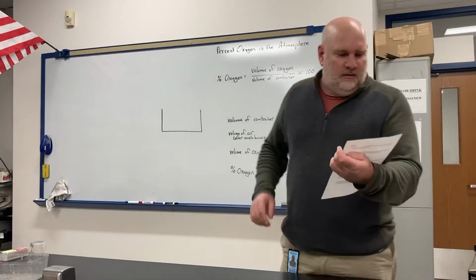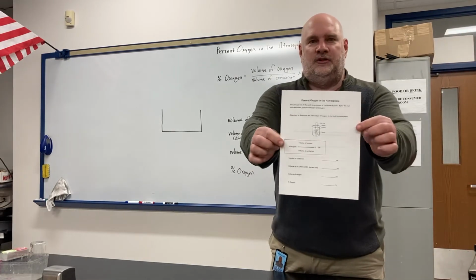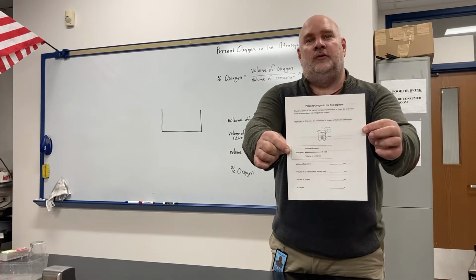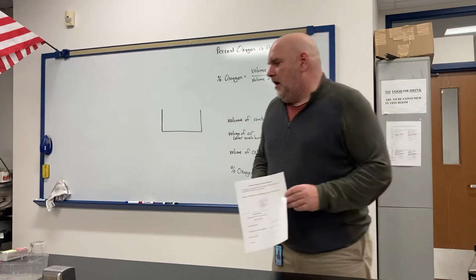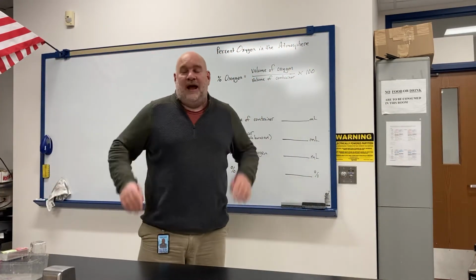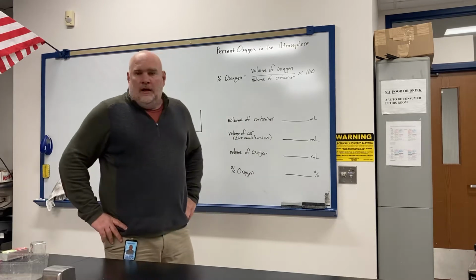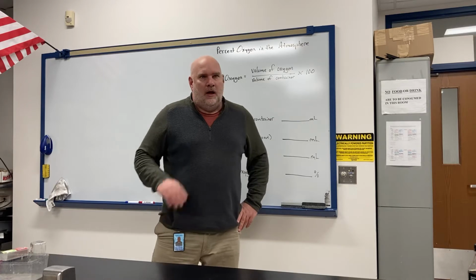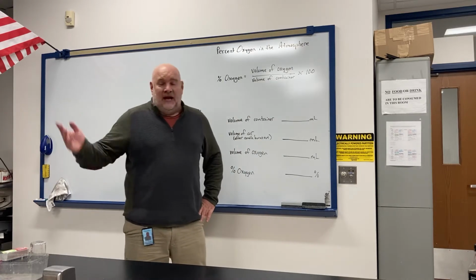All right, today we're doing the percent oxygen in the atmosphere lab. We're going to do an experiment to figure out what percent oxygen is in our atmosphere. Now, our atmosphere is made up of a whole bunch of different gases, but oxygen and nitrogen make up like 99% of them.